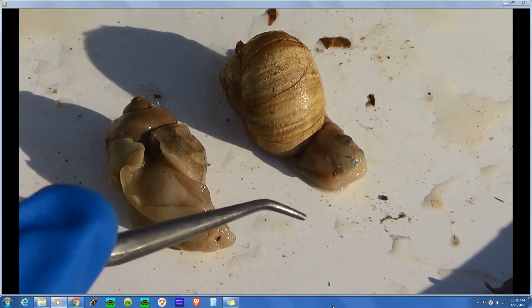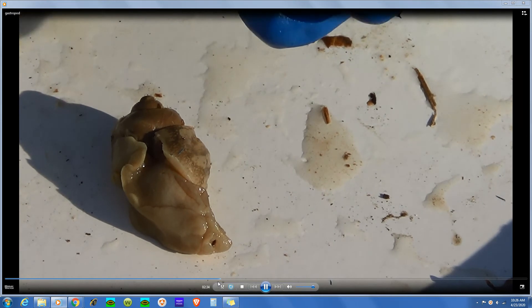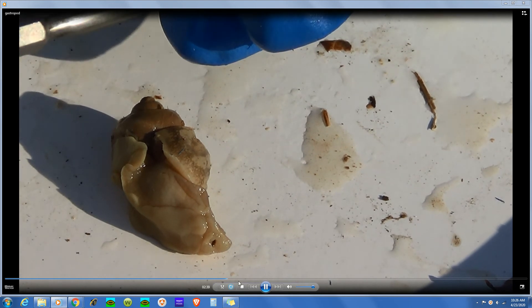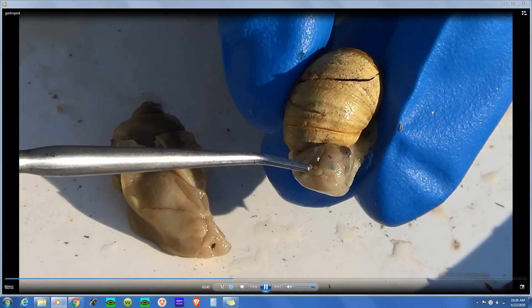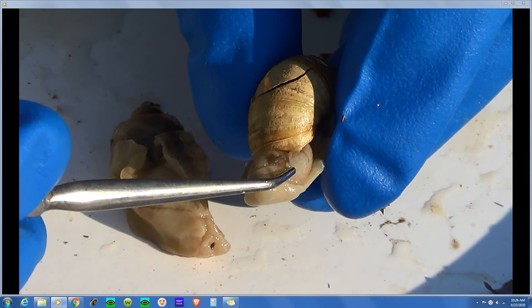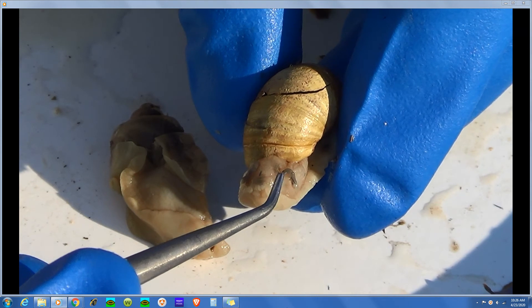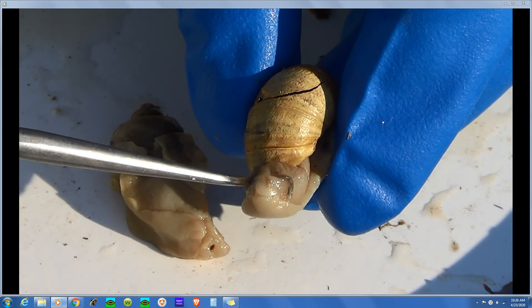You can see that the foot is wide and flat, and it uses that to propel itself. Here you can see an eye stalk on this side — there's an eye stalk. The eye stalk demonstrates their ability to use vision, and it's concentrated on the head end of the animal. That's called cephalization. The tentacles on this animal are not very distinct, so you probably can't see them on the video.